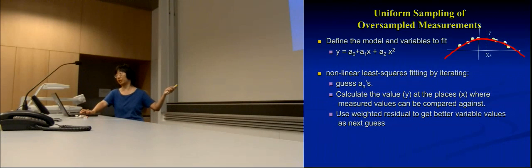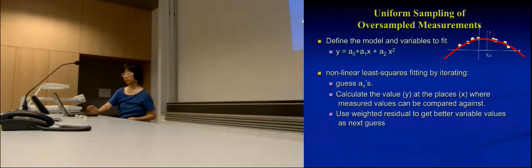You start with those guess values and then you do the same thing. Okay? So that's how you do the fitting. And most of the time, this is done inside the computer, calculated by its processor. You don't get to see it. So a lot of the time, there will be the third step.